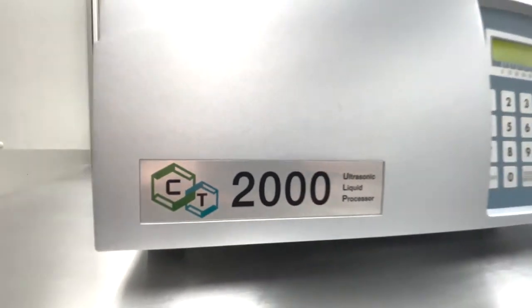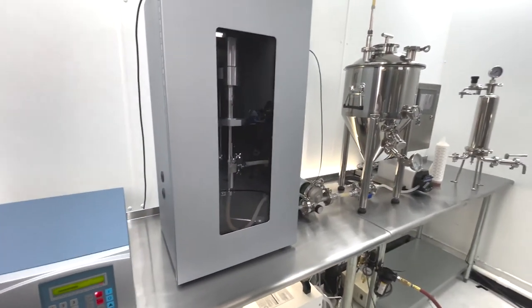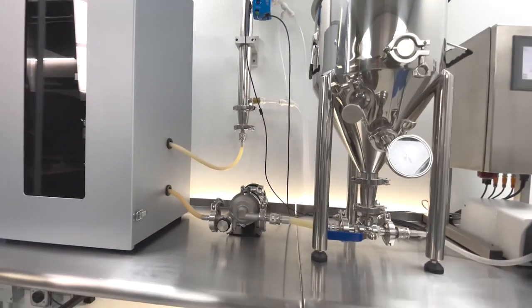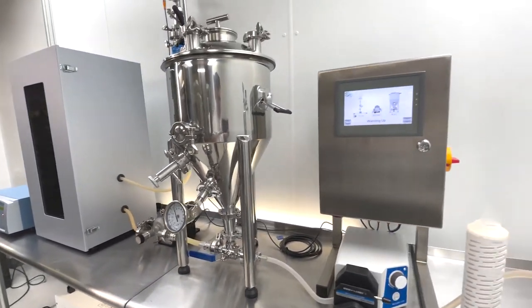The CT2000 turnkey package with available automation controller is the most advanced commercial scale ultrasonic liquid processor on the market. You can reliably produce top quality cannabinoid nano emulsions in-house at a very competitive price point.